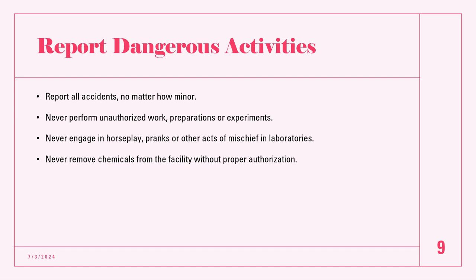Whenever there is any dangerous activity, please report to your supervisor. Report all accidents, no matter whether it's small, minor, or bigger. Never perform unauthorized work, preparations, or experiments. Never engage in horseplay, pranks, or other acts of mischief in laboratories. Never remove chemicals from the facility without proper authorization. These can prevent accidents and protect your life.